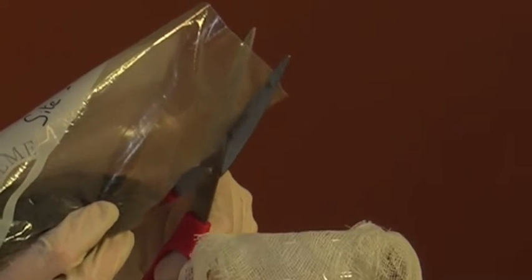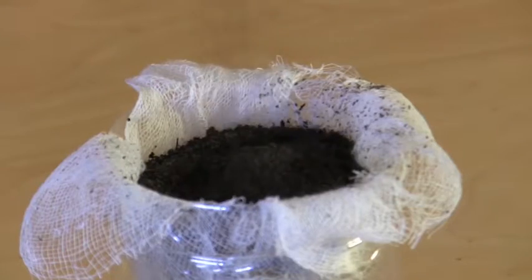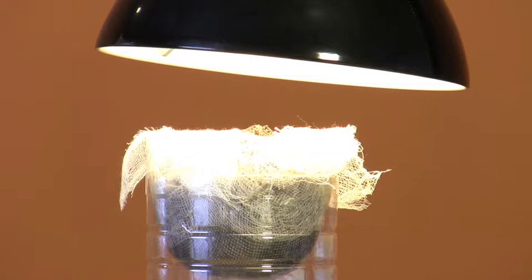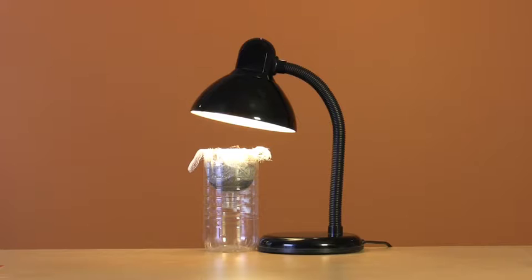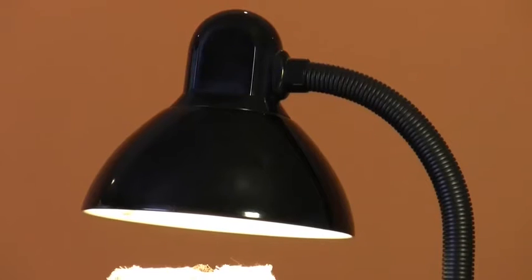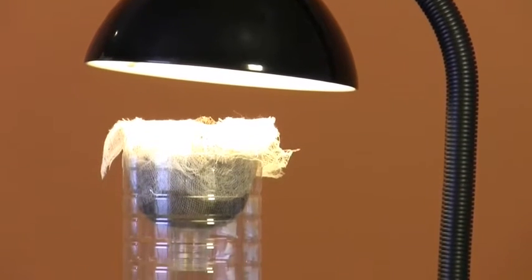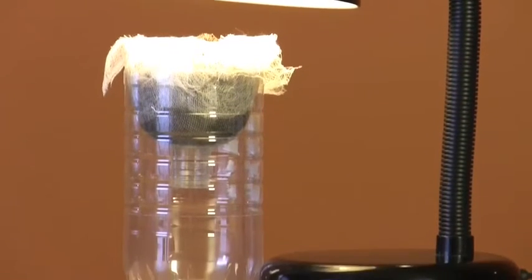Now it's time to empty your soil sample into the funnel. Switch on the lamp and angle it directly over the funnel, around 7 centimetres above the soil. You want the soil to reach about 30 to 35 degrees. It's a good idea to check this with a thermometer during your daily inspections.